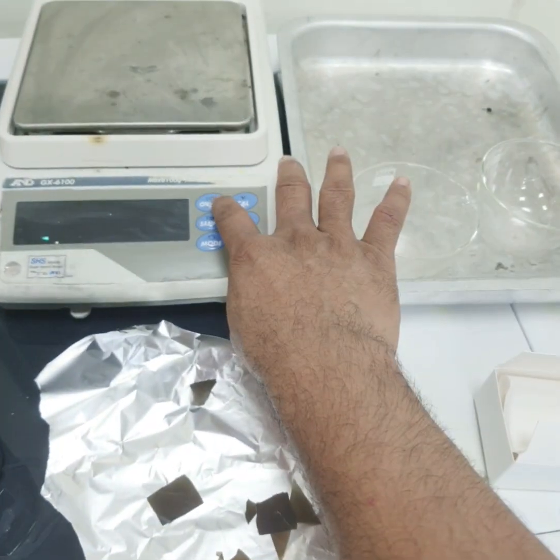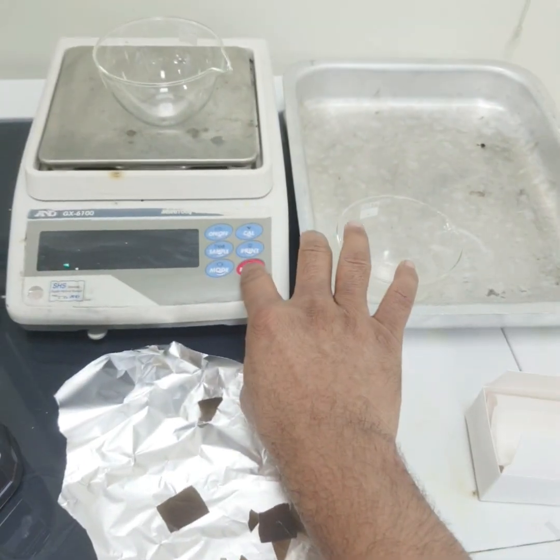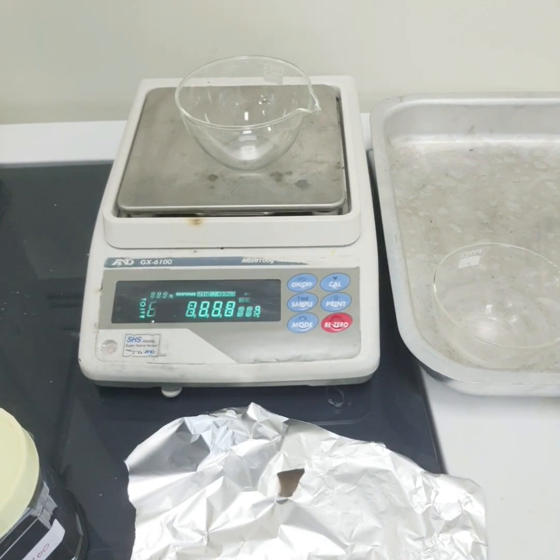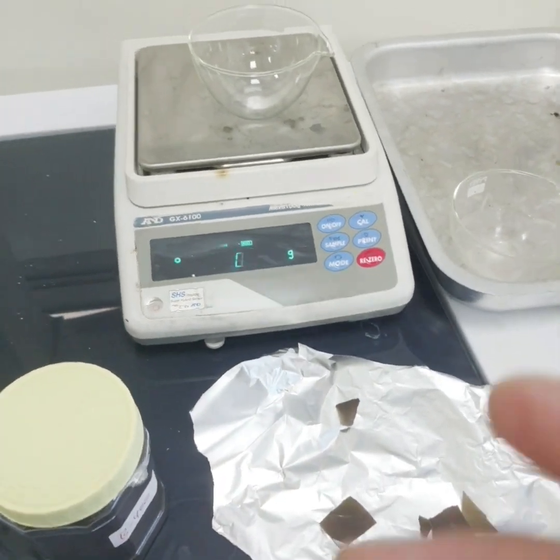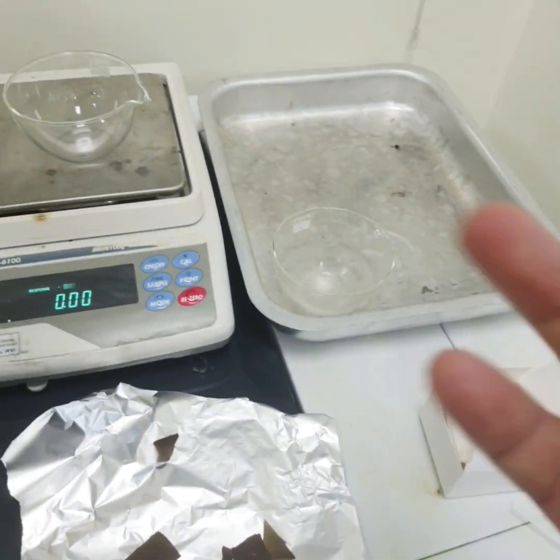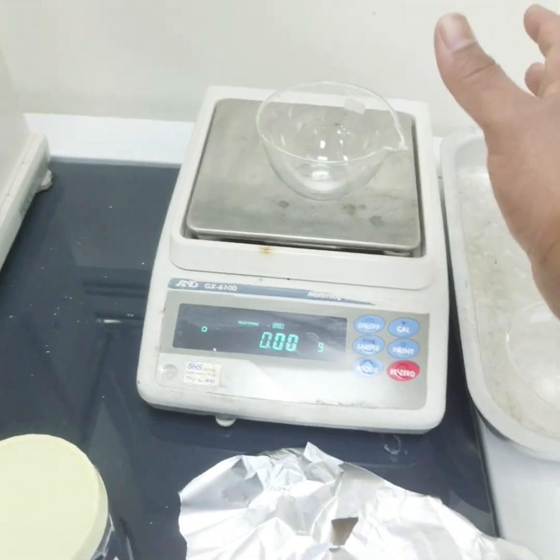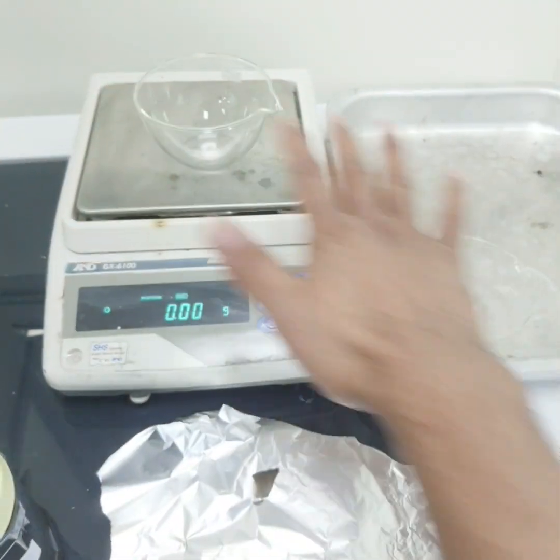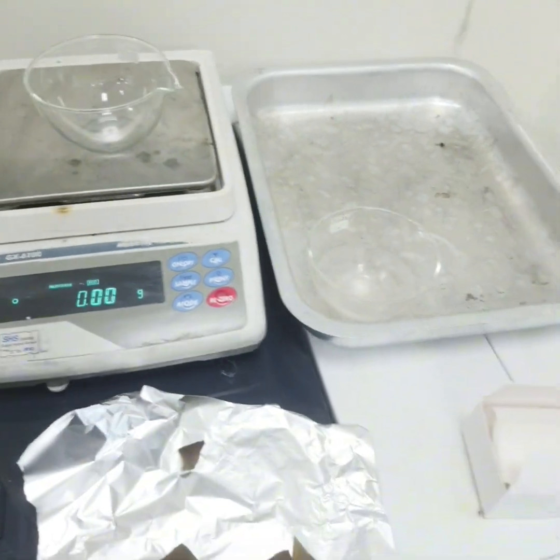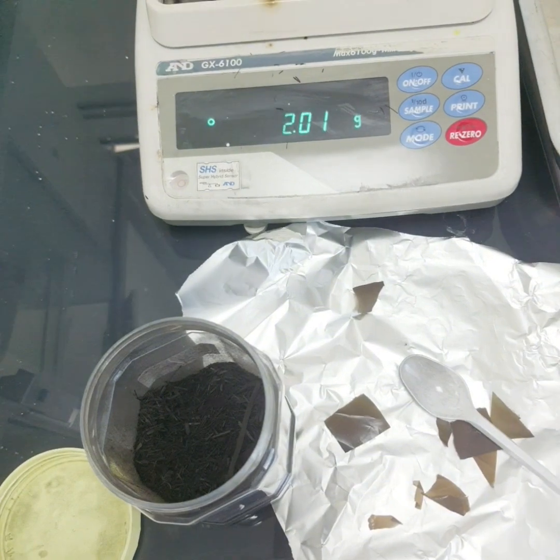First of all we will put our crucible here and tare it. You can also take the weight of the individual crucible and then take the final weights, but in that case the work is more tedious. Here we are taking the crucibles and adding around 2 grams in each of them. I am using the same biochar so as to minimize error. Taking 2 grams of the sample here, simultaneously I will take another 2 grams in another beaker.